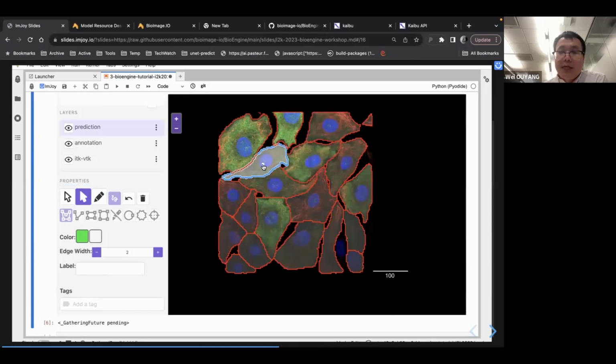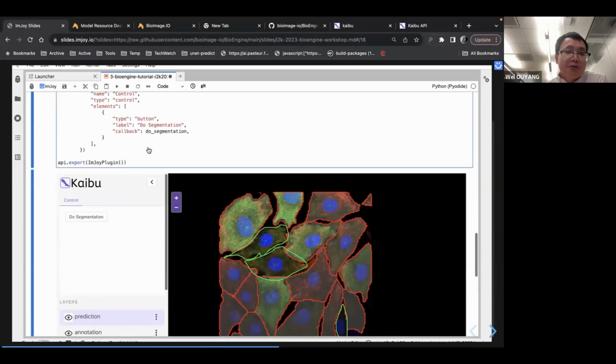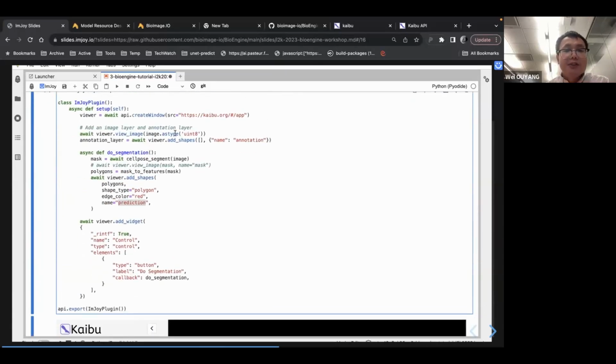Where you can edit, you can remove it, for example, right? So this actually allows you to, for example, add more. You can modify it and place it inside a kind of interactive annotation workflow, right? We're going to show you something later, but this is just something that allows you to make a quick application, right?